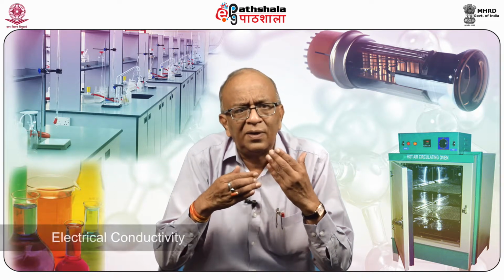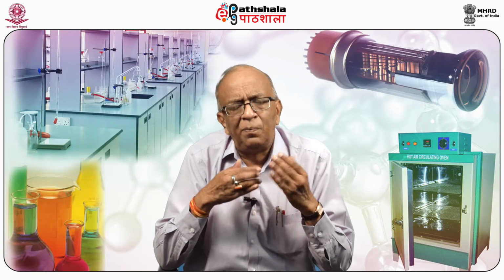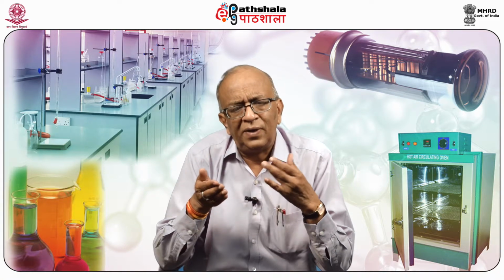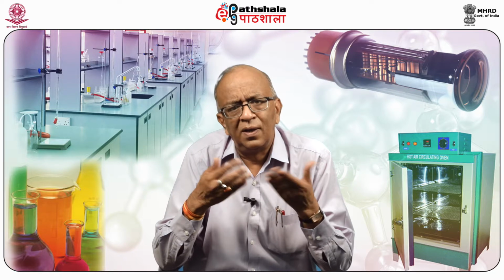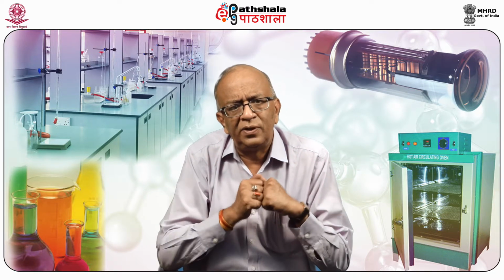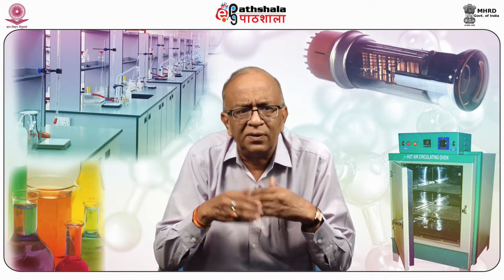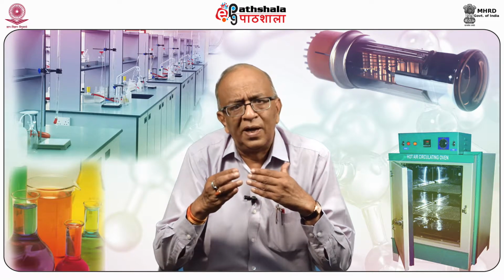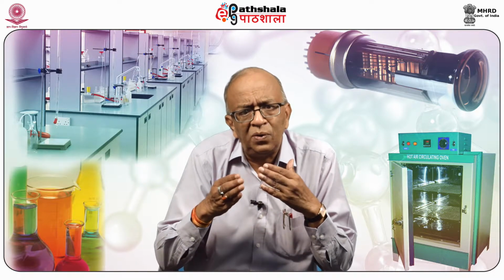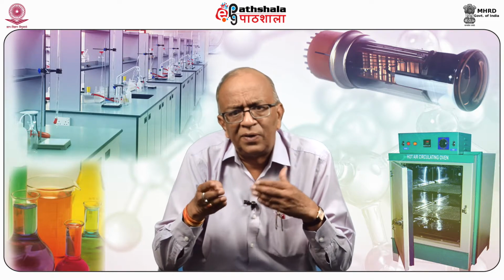Next one is electrical conductivity. Here an electrometer is used, and current is measured, and a plot of current versus temperature is drawn. Another type of thermoanalytical technique is emanation thermal analysis, represented as ETA. Here again, the radioactivity is measured with respect to temperature.